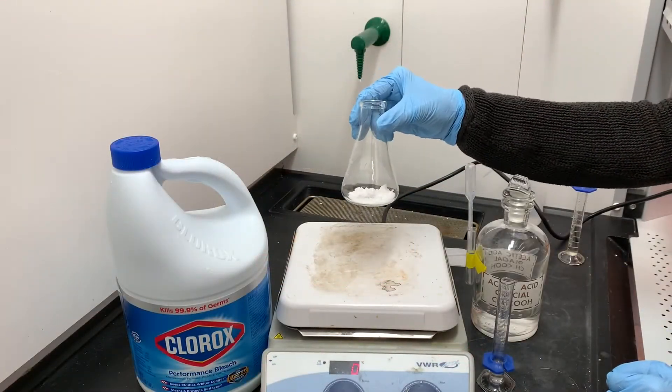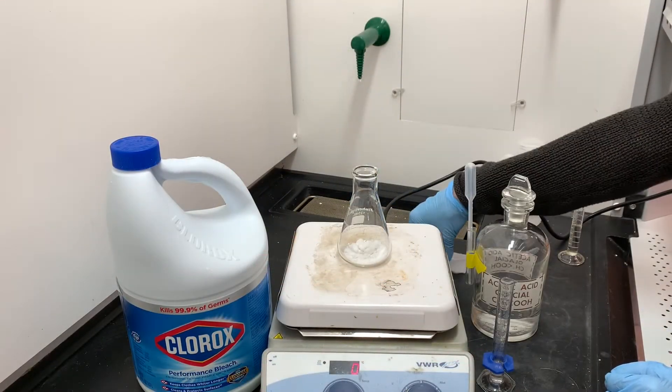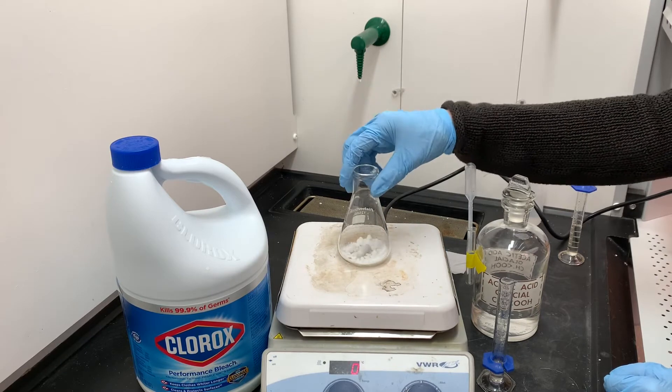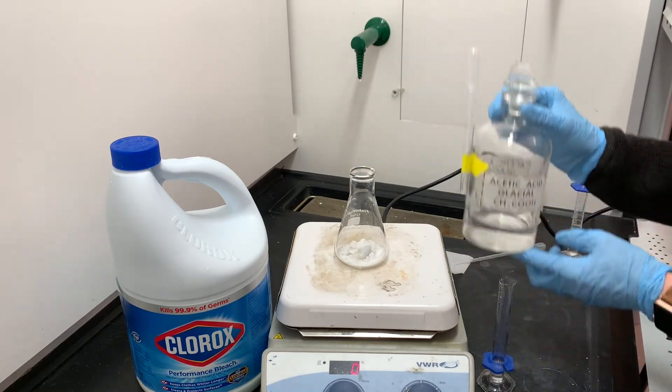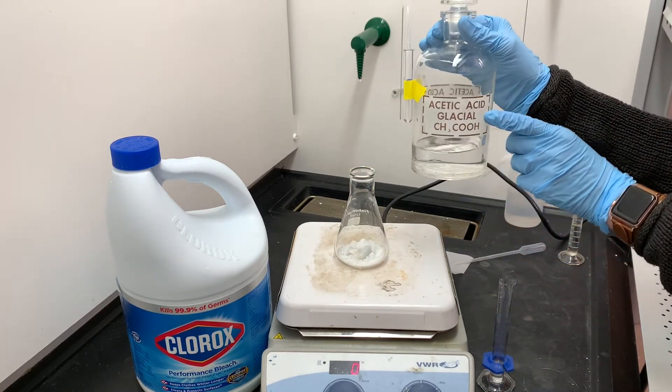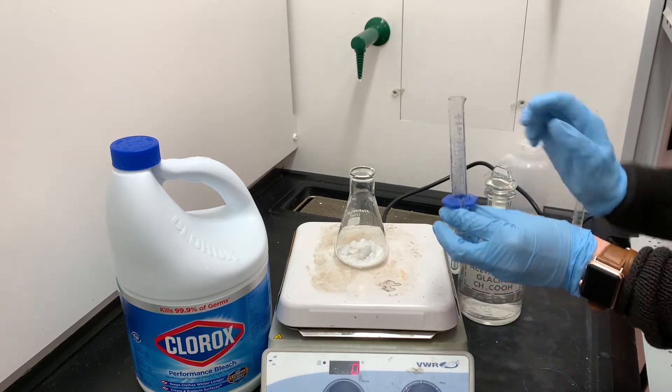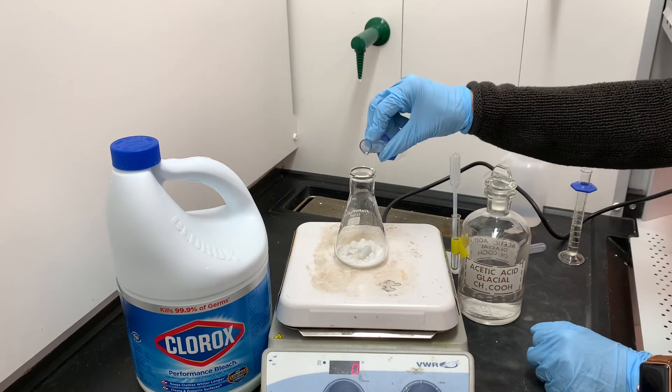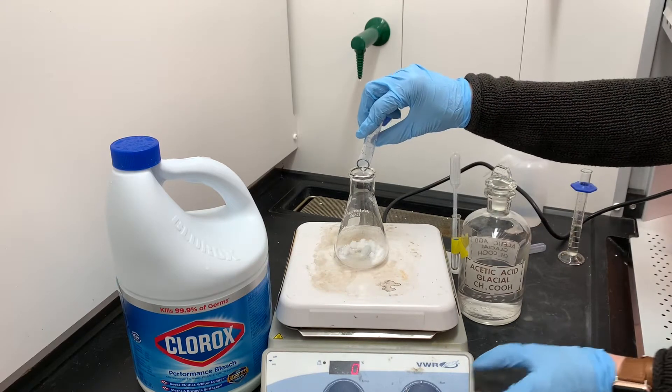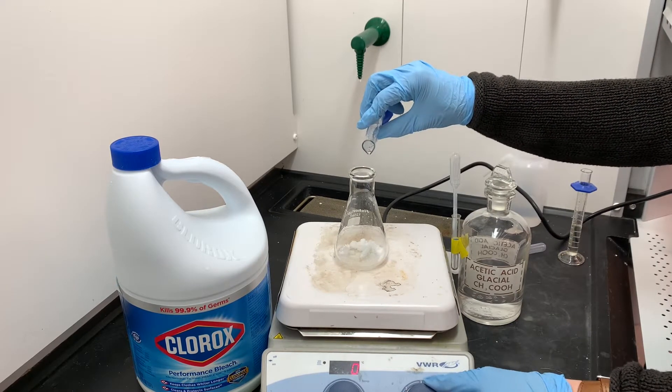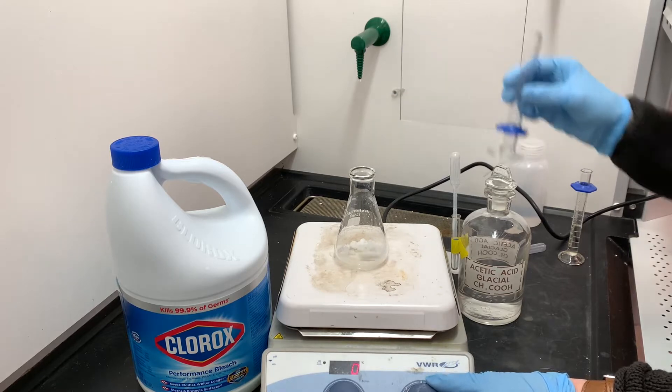I've transferred the isoborneol to this Erlenmeyer flask and I'm going to add a magnetic stirrer. The next ingredient that we'll be adding is the glacial acetic acid. Remember, glacial just simply means that it's concentrated. I've pre-measured the two milliliters of glacial acetic acid and I'll add that now, and then we'll start the magnetic stirrer to start getting this stuff mixing together.